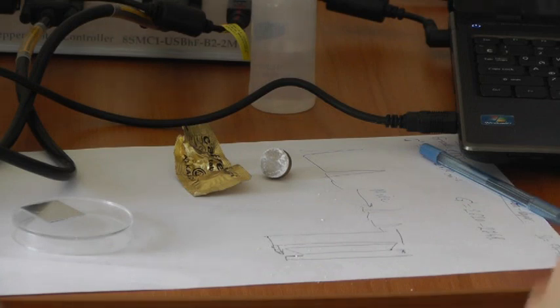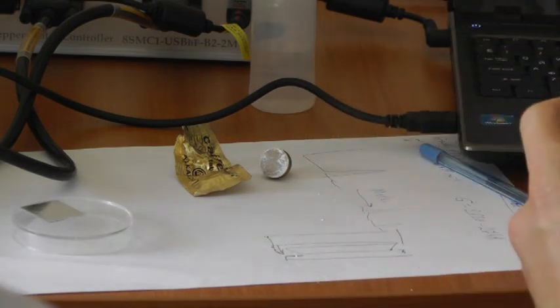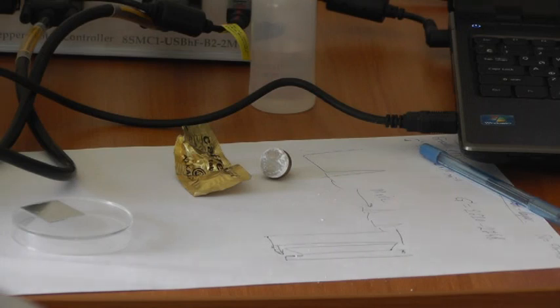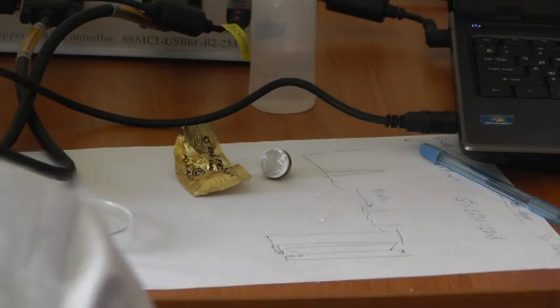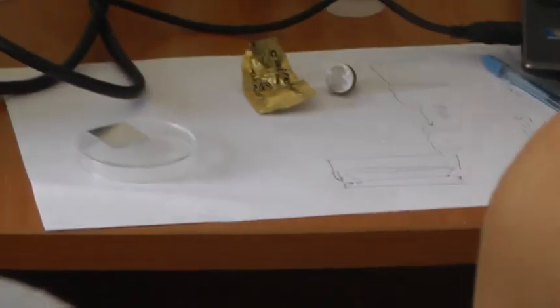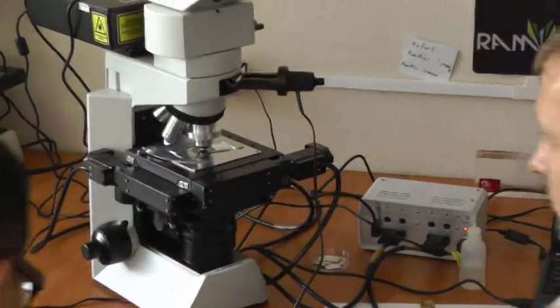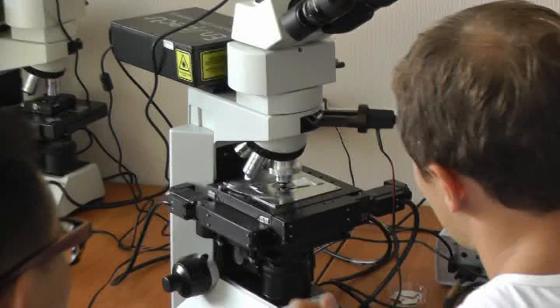So in this way, the spectra of every point will not be a combined spectra. Yes, they will be separated because we have strong spatial resolution of our system, and every spectrum will be taken from different spots, from different particles.